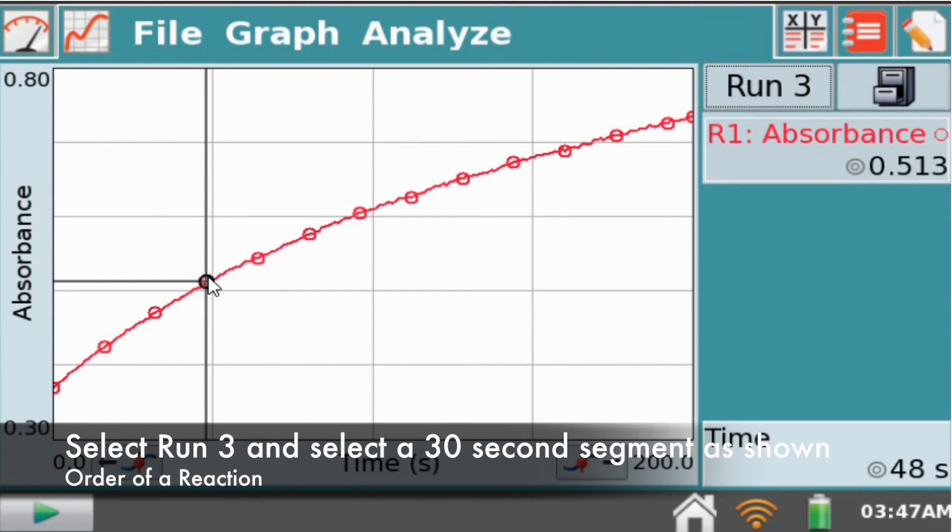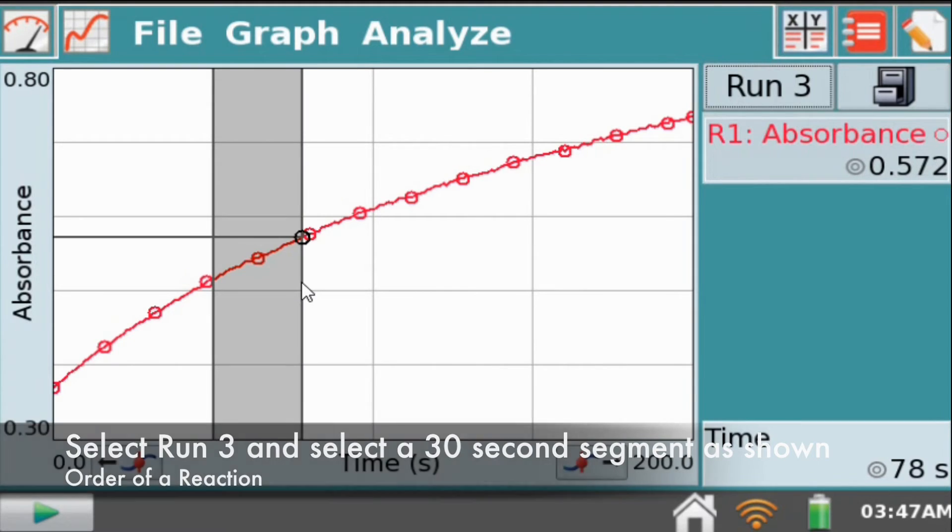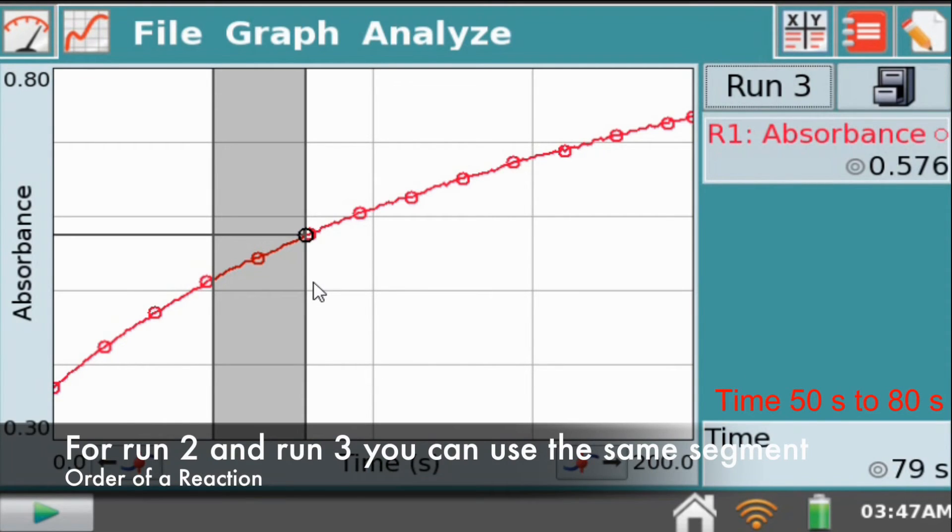In order to determine the rate of a reaction for a 30 second segment, we will first select a region on the graph as shown. On the lower right corner, time is displayed in seconds. You can use this as a guideline for the time segment. Here, we have chosen a 30 second segment starting from 50 seconds to 80 seconds.